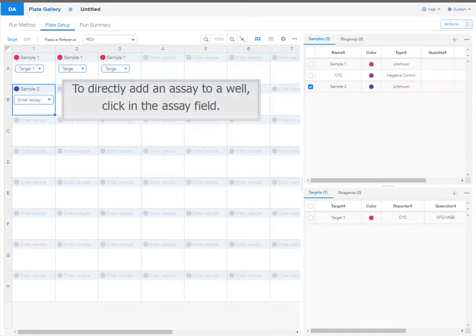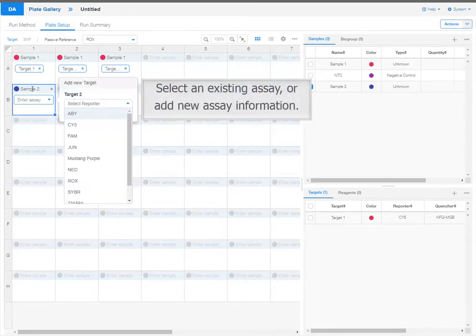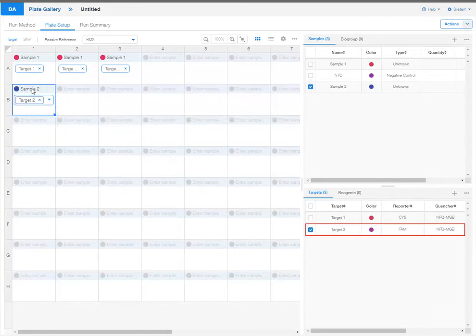To directly add an assay to a well, click in the assay field. Select an existing assay or enter new assay information. The new assay is added to the assay table.